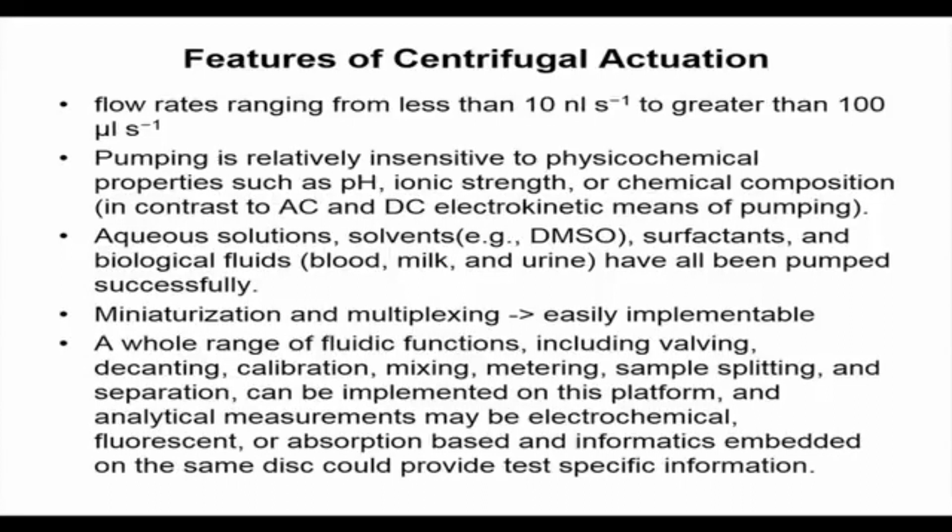Different solvents, surfactants, and biological fluids like blood, milk, urine have been pumped successfully; these have already been technologically established. Miniaturization and multiplexing are easily implementable, so you can make microchannels on the CD quite easily, and you can study multiple reactions on the same CD platform, which is called multiplexing.